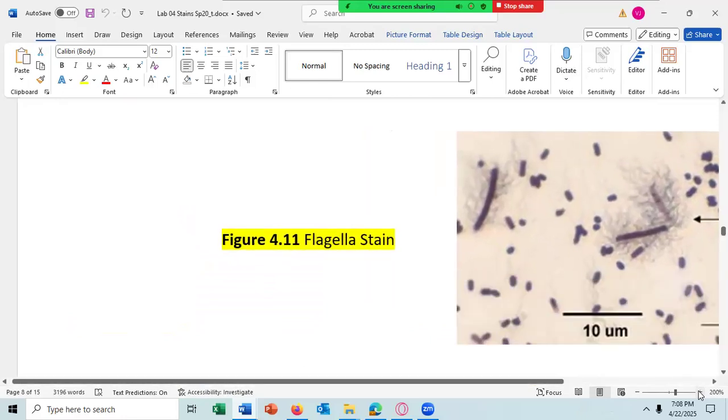And these cells have been stained for the flagella arrangement. You can note it looks like that cell has no flagella, or it might maybe one. That cell might have no flagella. That cell here has one flagella right there.